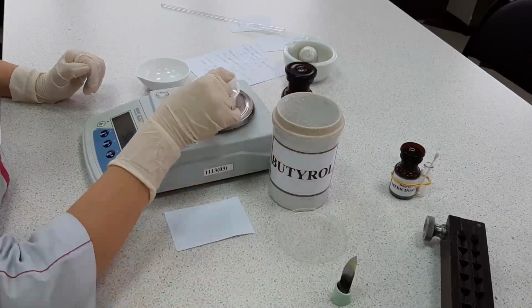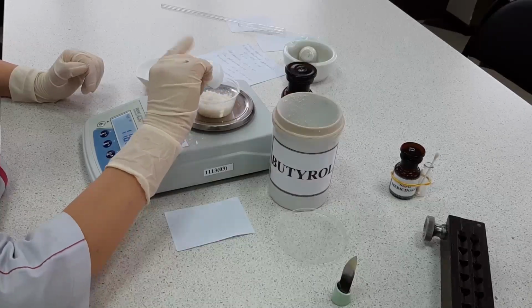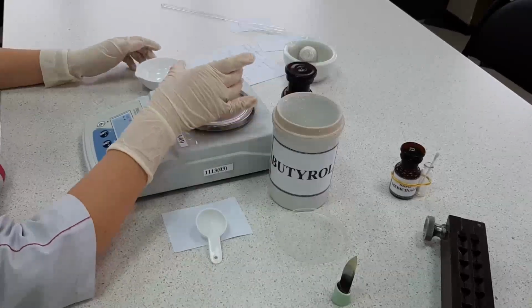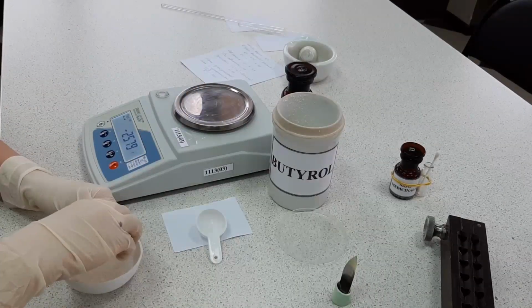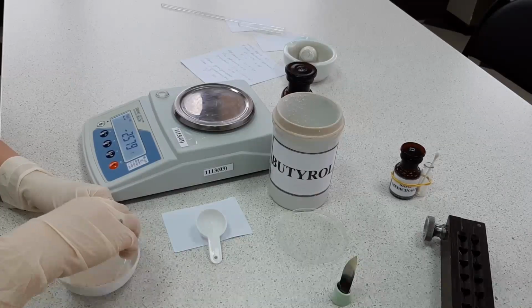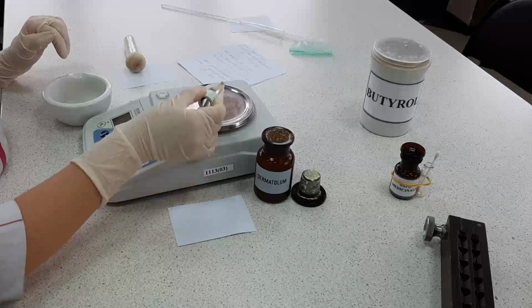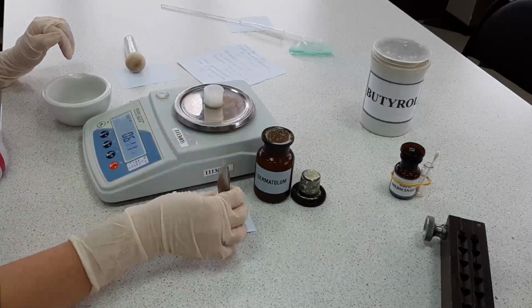The technology includes the following. Weigh the calculated amount of butyrol and place it in a porcelain cup, then place it in a water bath for melting. Weigh the calculated amount of dermatol and put it in a mortar.